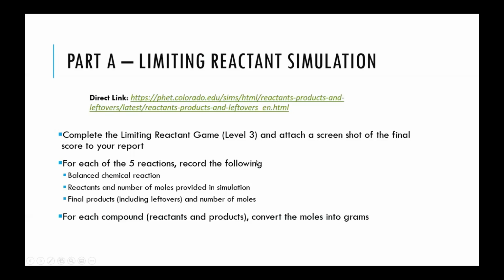And for those reactions, you're going to record what is the balanced chemical reaction, and that's just given in the simulation, and the number of moles of reactant and product that is given in the simulation.